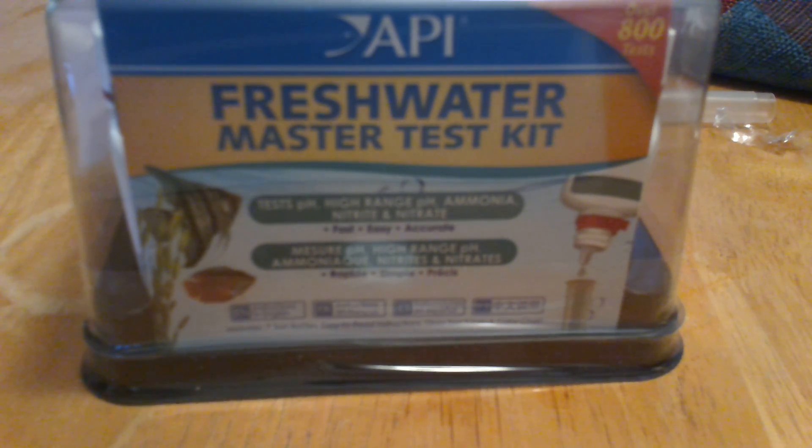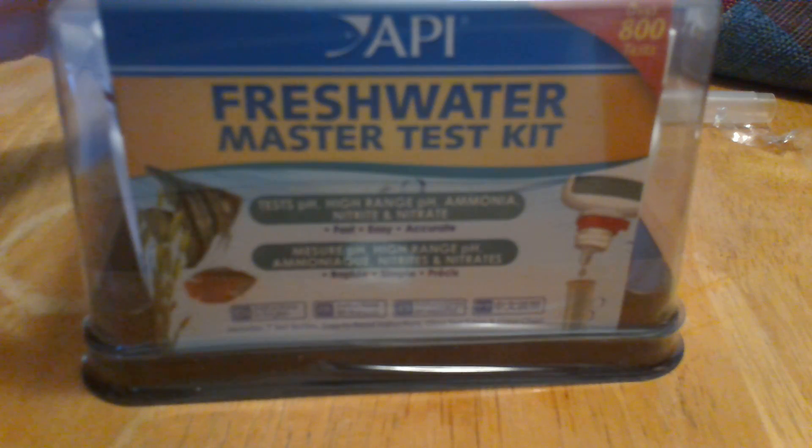Alright, this other thing I got is a freshwater master test kit. I got it for pretty cheap on Amazon. This is the first time opening it up right now, so you're witnessing it as I am.